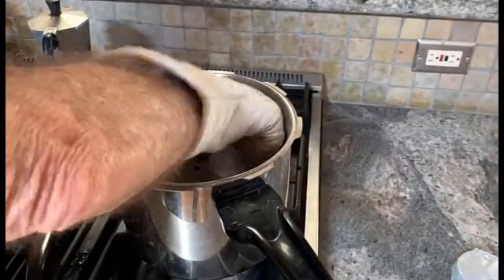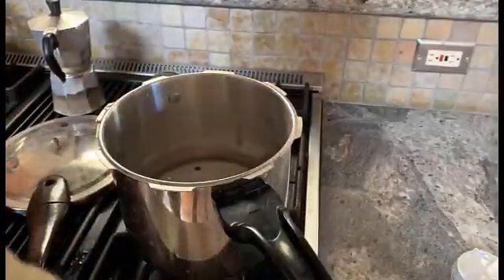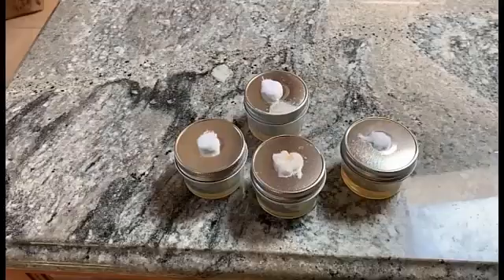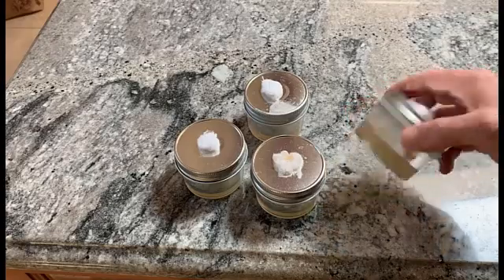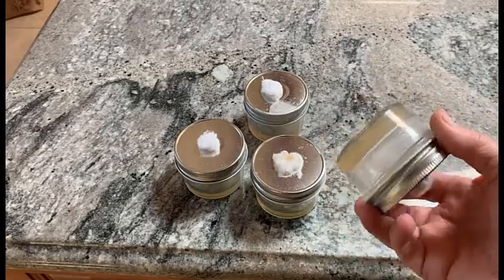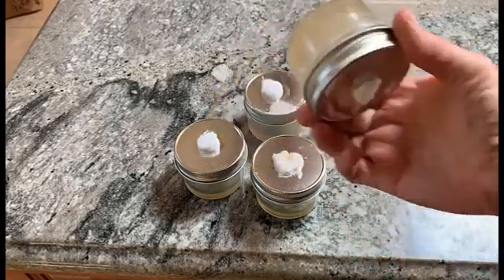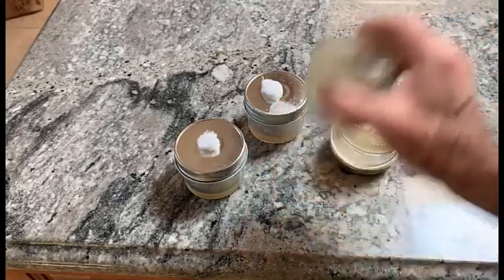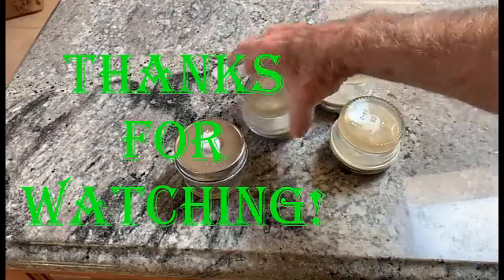Allow it to cool until they've congealed and it's back down to room temperature before use. Here are the finished high-performance agar plates. I usually keep them upside down to prevent moisture from accumulating on the agar itself.